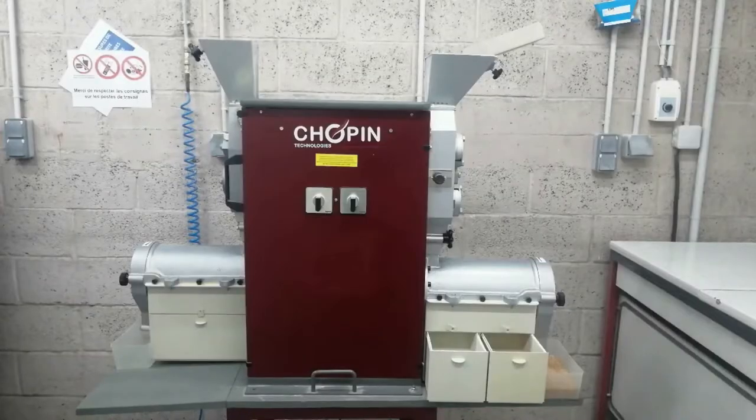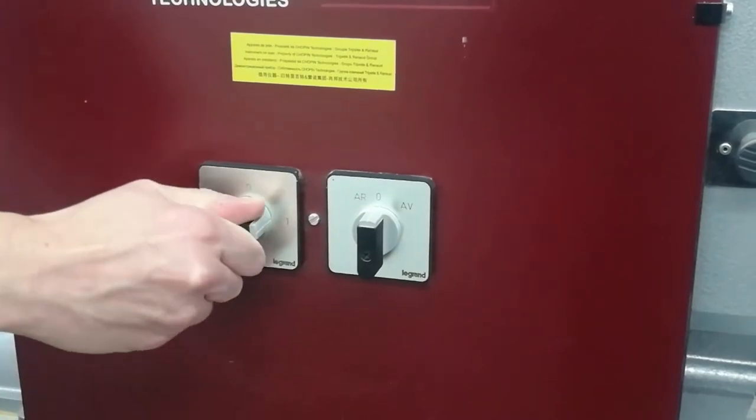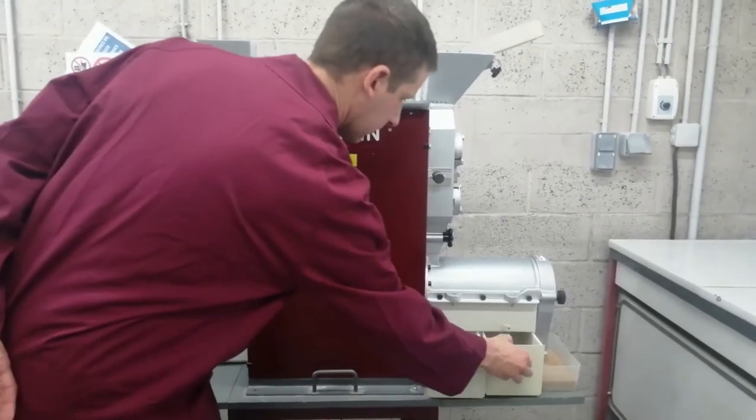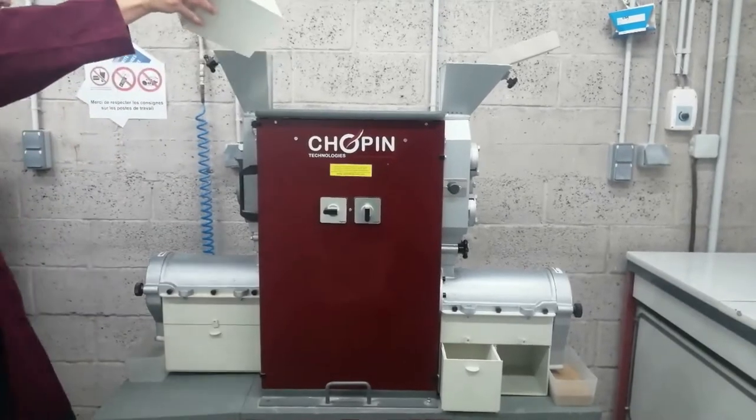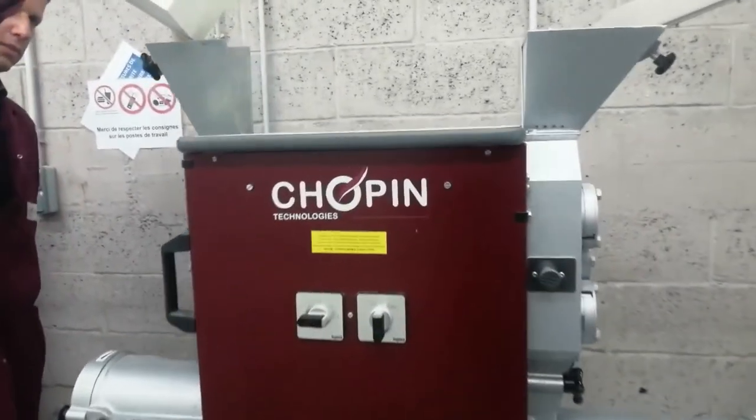The second step of the milling consists in reducing middlings. To do this, turn the left knob clockwise. The instrument starts up, and you can then pour the middlings obtained during the breaking into the left hopper.